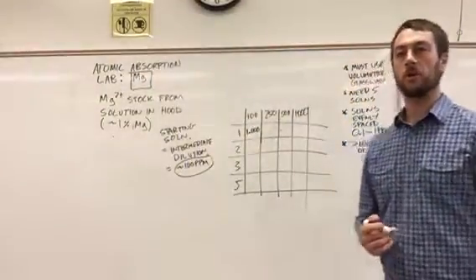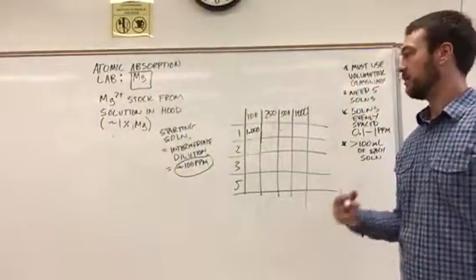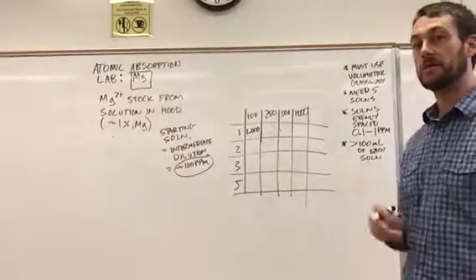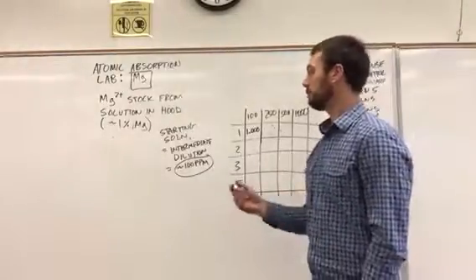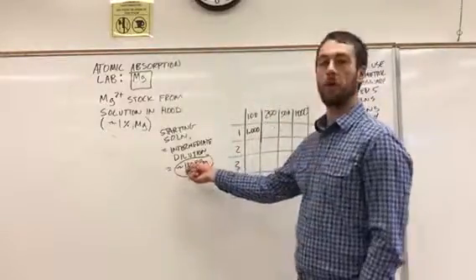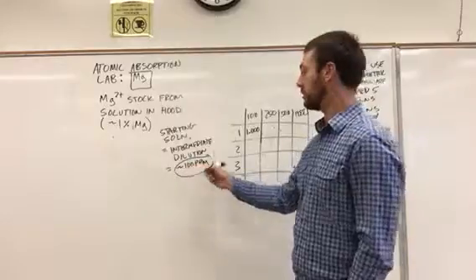Okay, so where we left off last time was we had just made our intermediate dilution from the magnesium solution that's in the hood. So the starting solution for our chart is going to be the 100 ppm intermediate dilution, right?